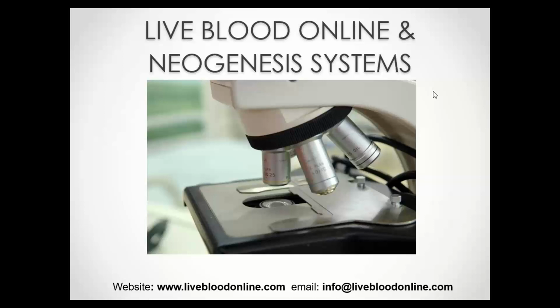We're obviously not able to see everything, so there are some cases where further tests may be necessary. For instance, we would see signs of a viral infection, but we won't necessarily know what type of virus it is, or there may be signs of an allergy, but we won't know what specifically the client is allergic to. Further investigations in those cases are then needed, to provide more detail.